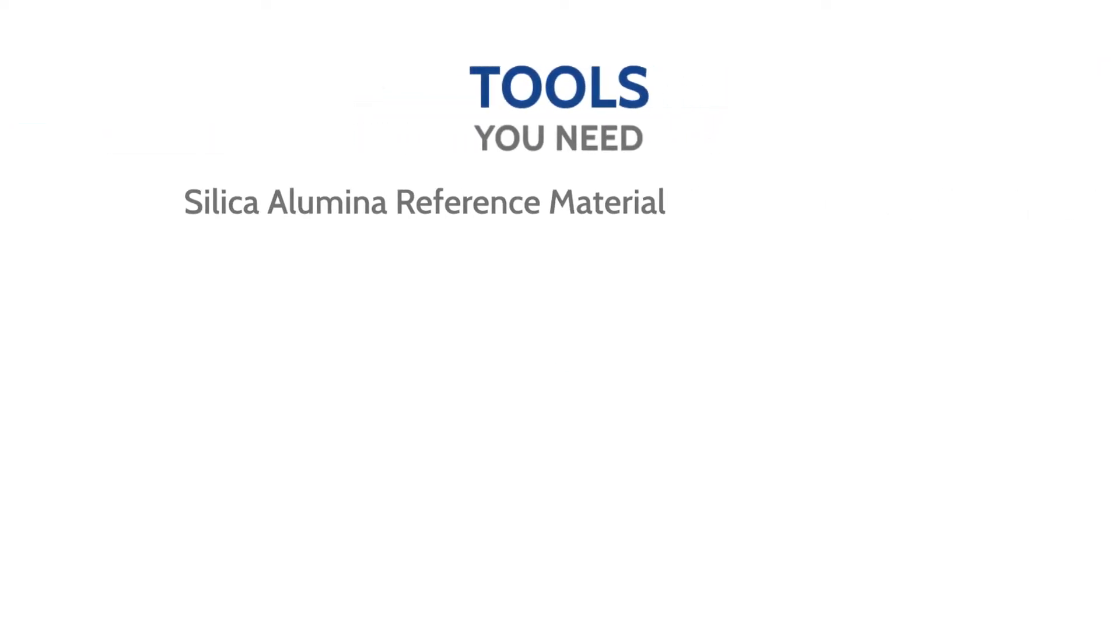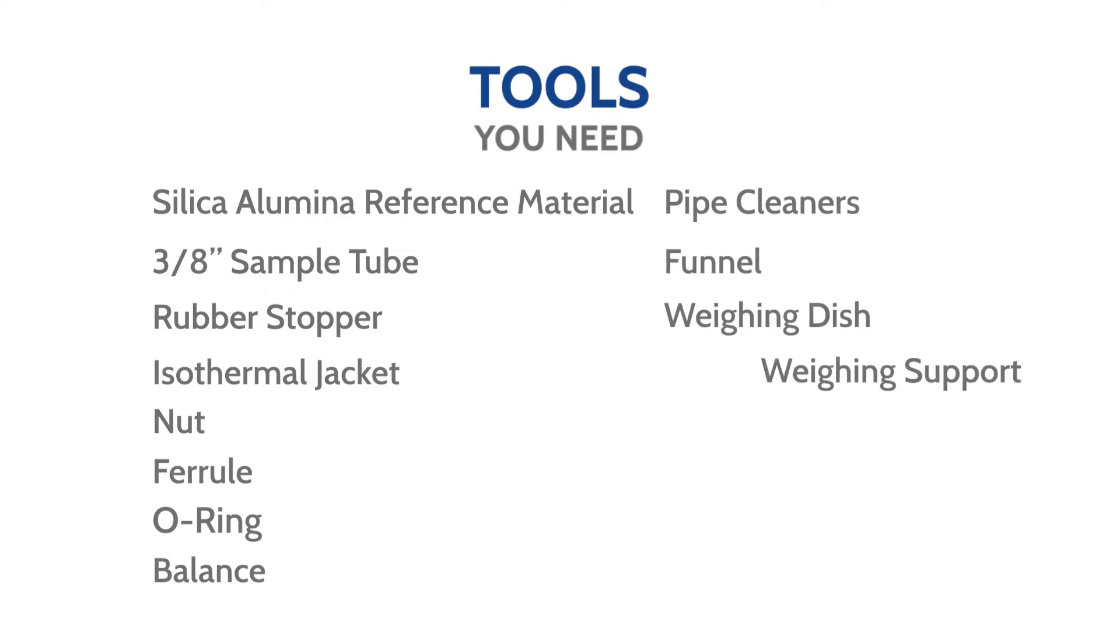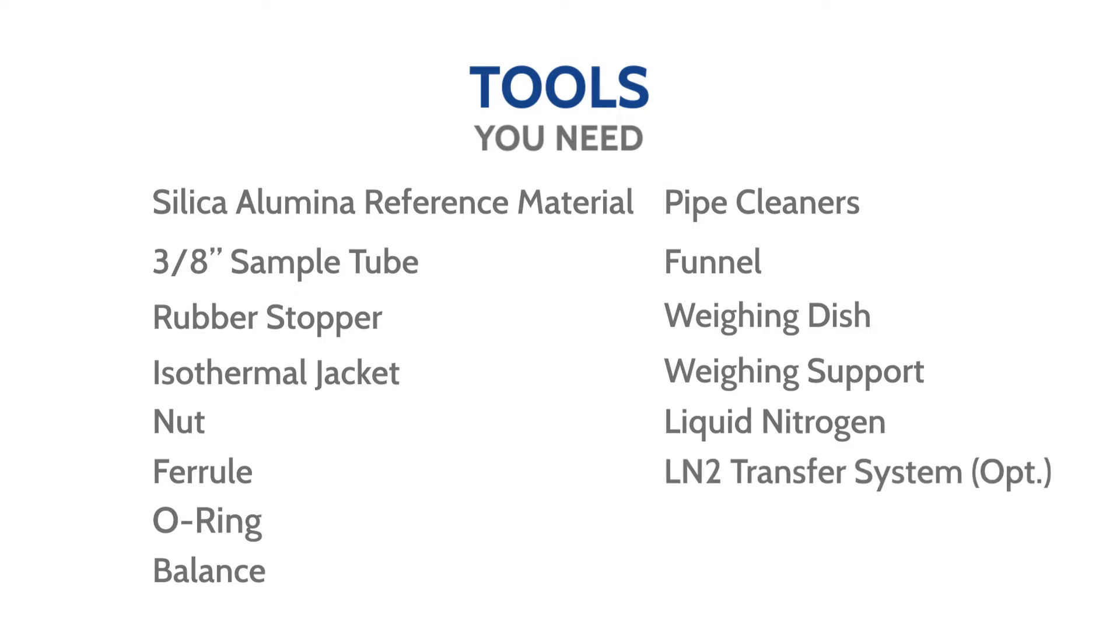The materials used in this video are Micromeritics Silica Alumina Reference Material, a 3/8 inch sample tube, a rubber stopper, an isothermal jacket, a nut, a ferrule, an o-ring, a balance, pipe cleaners, a funnel, a weighing dish, a weighing support, liquid nitrogen, liquid nitrogen transfer system, a dipstick, and personal protective equipment.